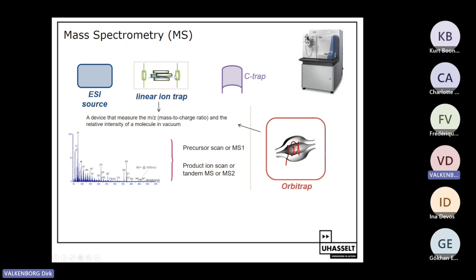The advantage of having these 2 mass spectrometers in one big box is that the Orbitrap has a high mass accuracy, high resolution properties, and generates very good informative mass spectra. So typically we want to have a precursor scan or an MS1 scan of very high quality. However, such a high quality scan requires some amount of time. Typically that's 1 second, which is not so long in a human life, but when generating mass spectra, 1 second is already a little bit too slow for us.